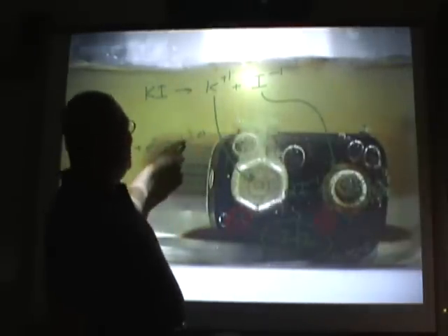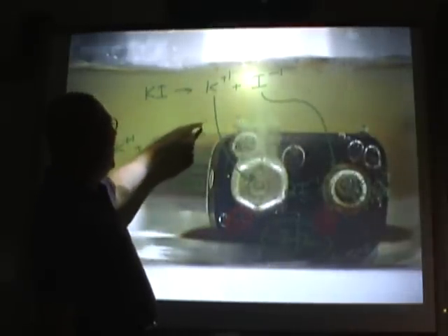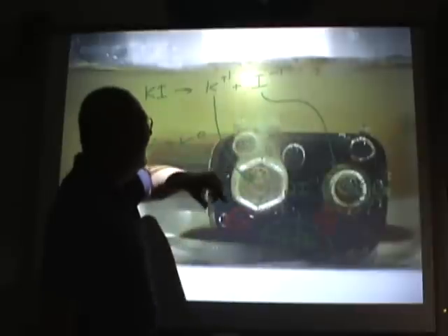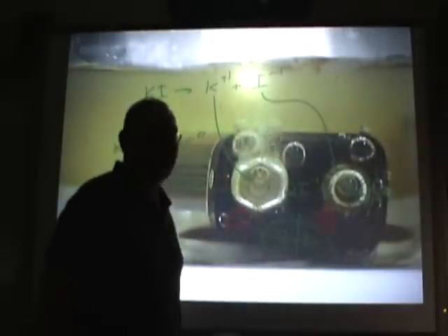Oh, look, all sorts of stuff is happening. Look at all that stuff floating around. Oh, man, I'll bet you that's pieces from the inside of the battery. Remember, don't try this at home.